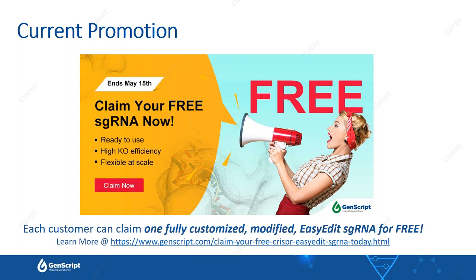Another question, are there instances where using a crRNA, tracrRNA duplex is more effective than the sgRNA method? Right, so I think there is some debate in the literature and the community about which system is better. I think internally we do have data that shows that our sgRNA outperforms the CRISPR tracrRNA. That being said, of course, every gene is a little bit different, and it is a test-and-go thing no matter what.